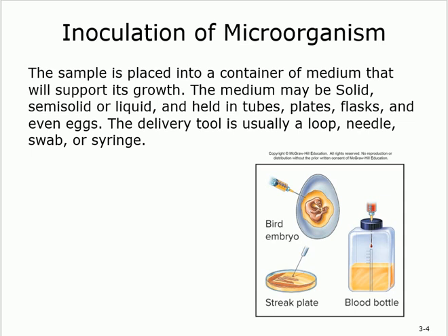So the first thing is inoculation. How to inoculate? Inoculation, again, to inoculate means to get a sample and put it in the medium. Okay? How to get it? You take it from anything, and I mentioned that before, right? Body fluid, body tissues, anything, animals, plants, volcanoes, water, anything. And you study it and you will know what kind of organism is there.